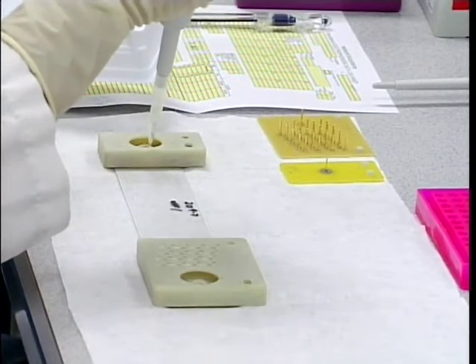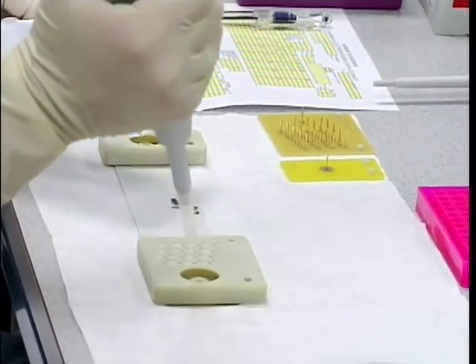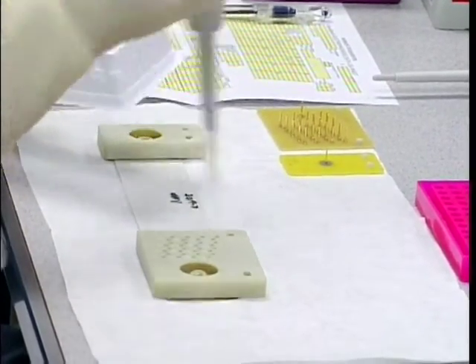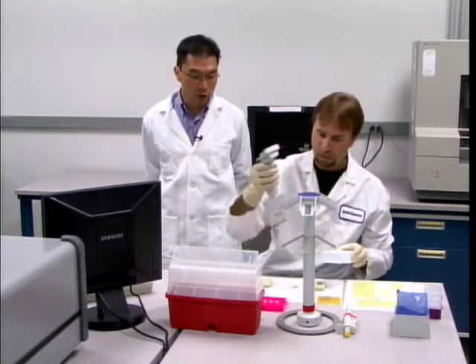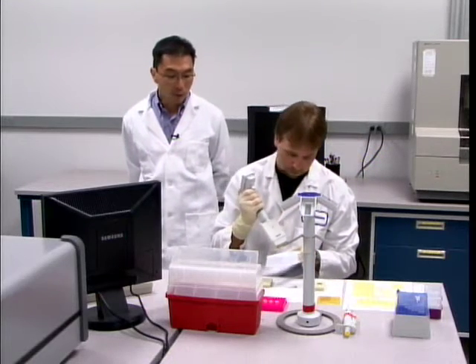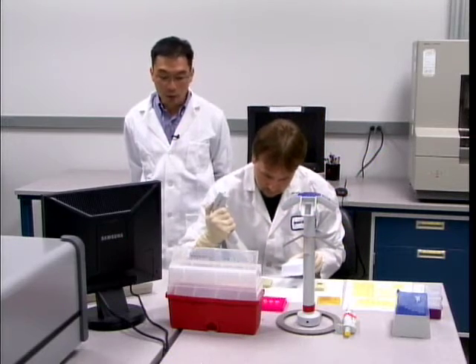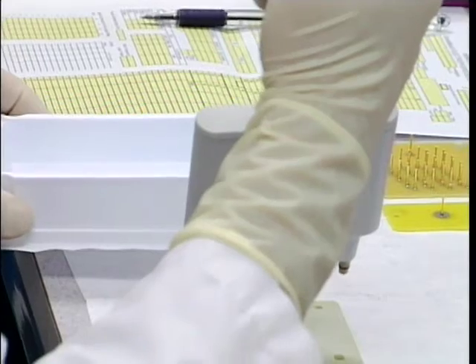The buffer we're using for separation is TTE 1X. Mark is currently inserting the buffer into the anode and cathode wells of the separation chip. In addition, buffers also need to be inserted into the waste wells of each of the separation channels.